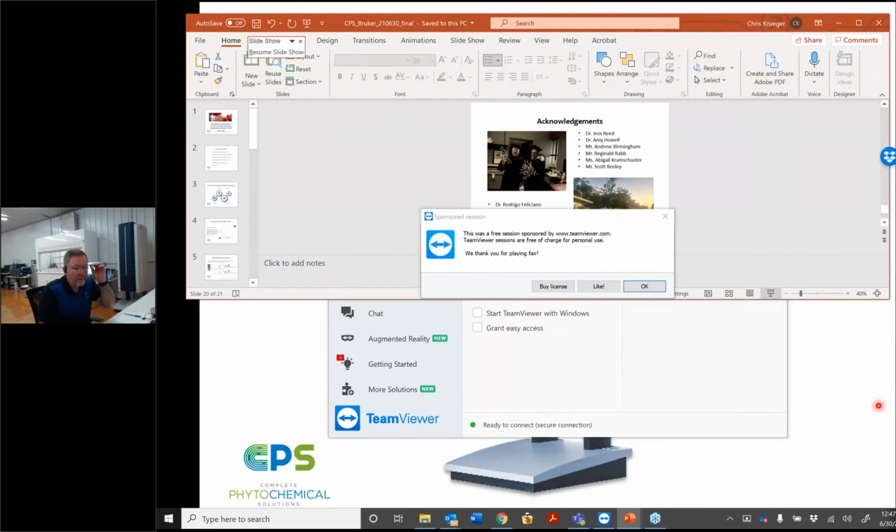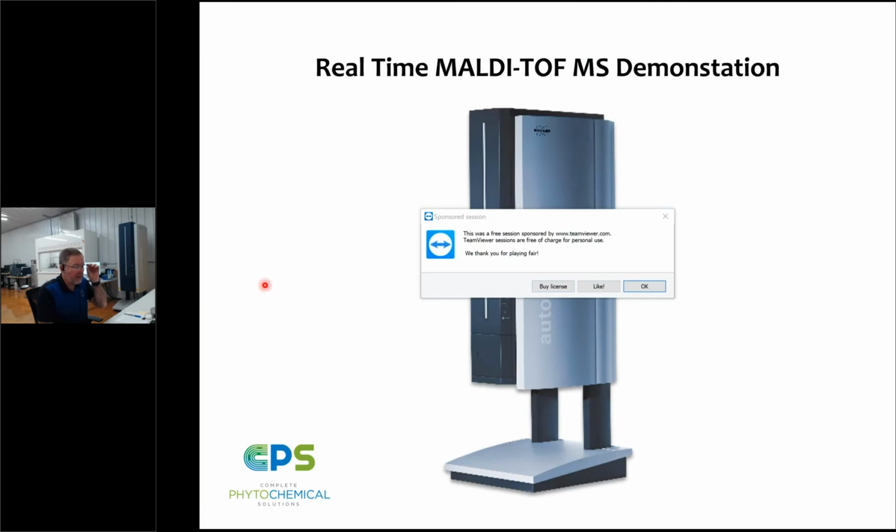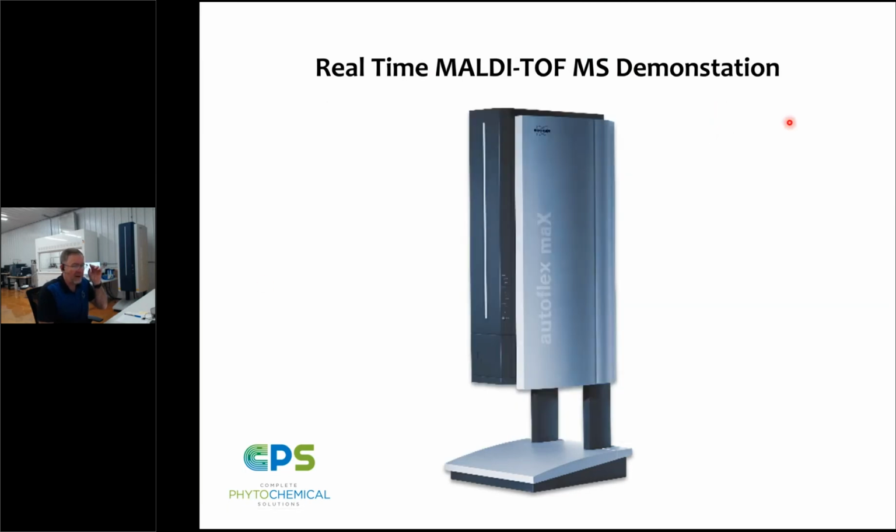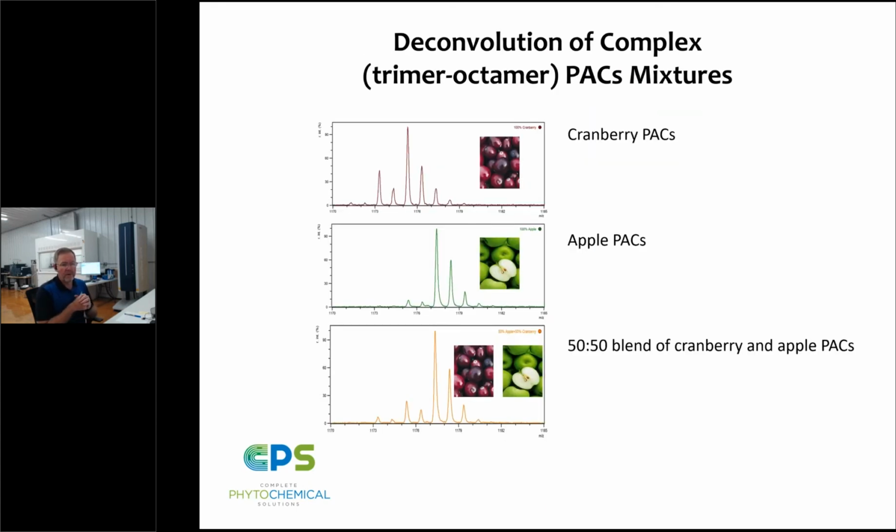Bring this up. And we can go through a little bit more explanation. Okay, thank you very much, TeamViewer. You can go, goodbye. A little bit more about the explanation of what we just saw.